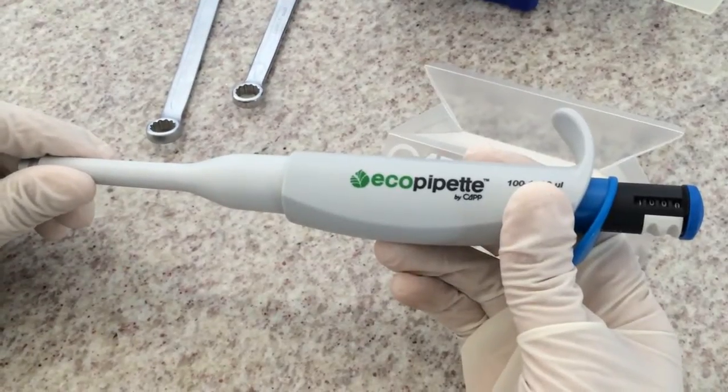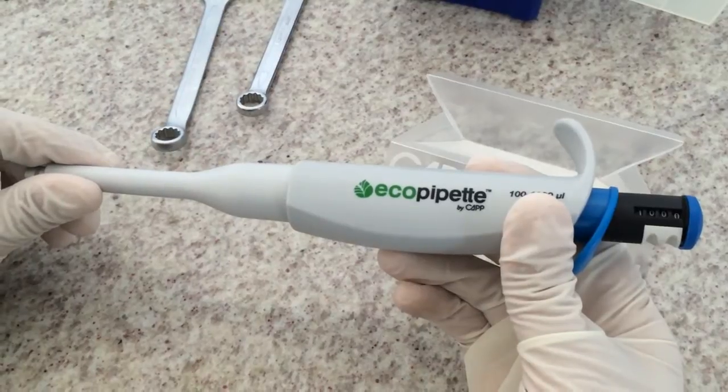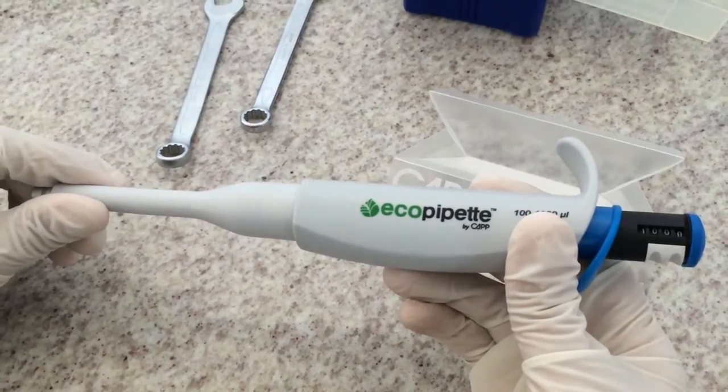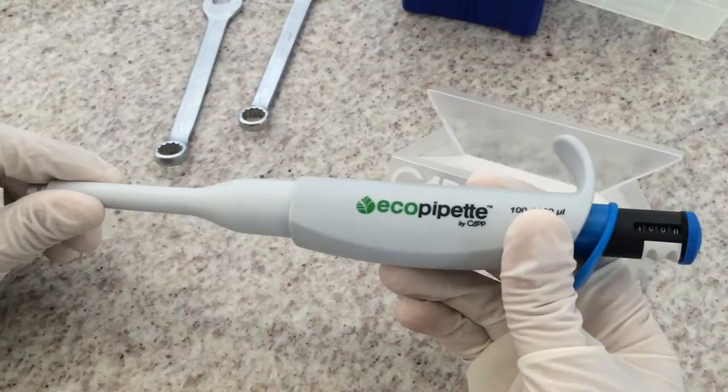Today we are going to perform troubleshooting of Capp Aero or Ecopipette 100 to 1000 µL and perform its entire disassembly. If the pipette is not dispensing the right volume, make sure you have watched the functionality test video prior to this one.